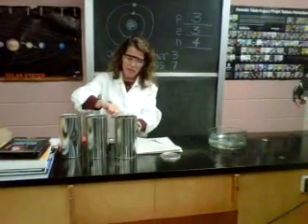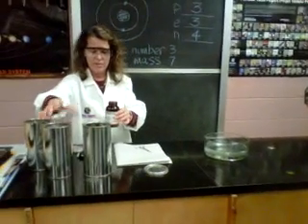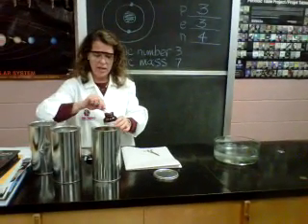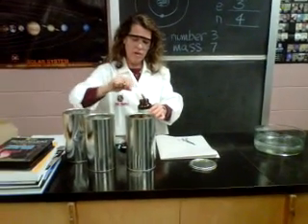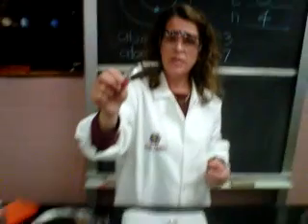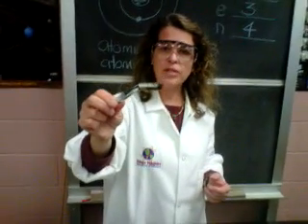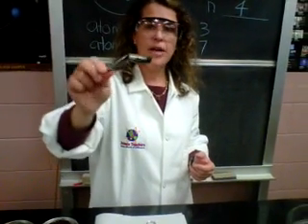So here's what lithium looks like. You have to store it in these double containers. I was going to say physical property. Show them. That's lithium. I'm going to pull it out. Lithium, remember, is an alkali metal, so it's a metal. It has properties of metals. What are some that you're noticing right now? It's shiny, right?